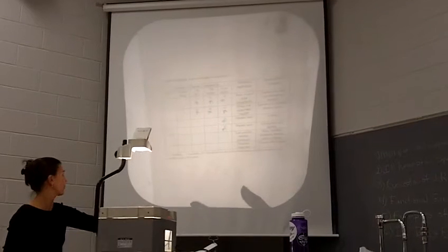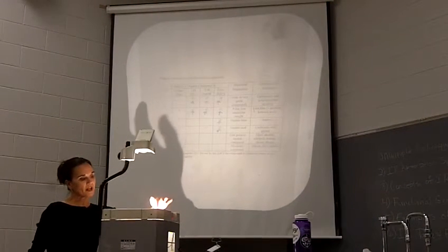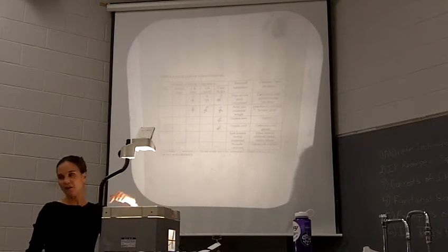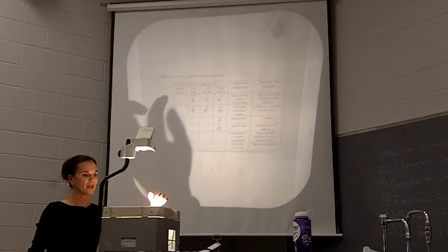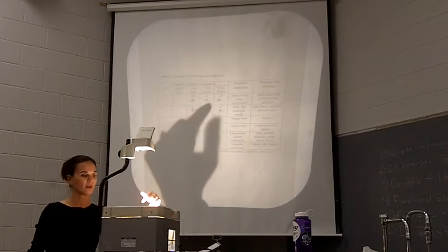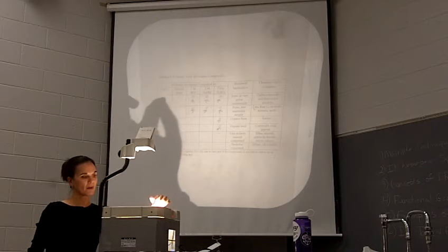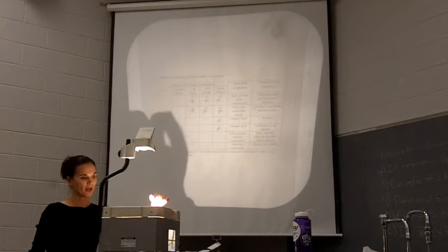So this is table 6.1, in experiment 6. What you want to do with this table is make sure that you follow it in order, okay? Because it's really important that you pay attention to whether things are soluble or not as you go along in the table. So for example, in this top row here, you always start with water, see if it's soluble or not.